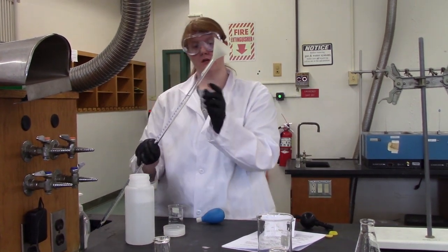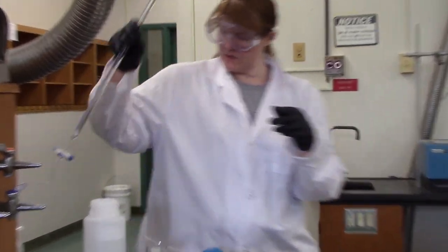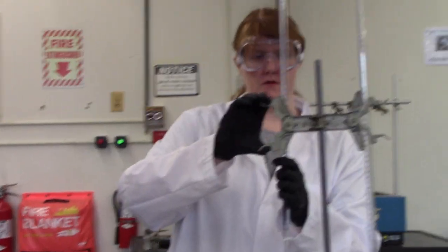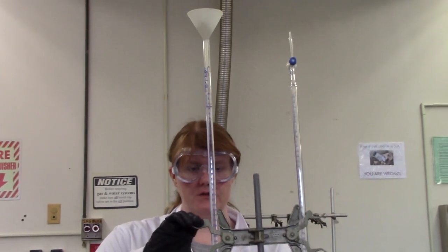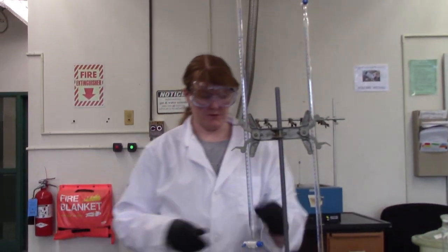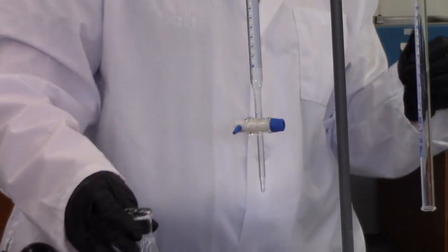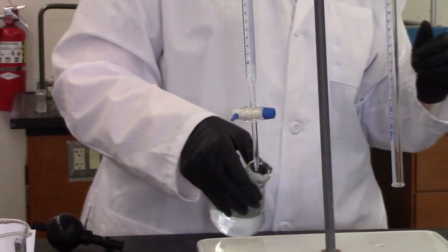Another note of caution, remember that the funnel occupies some space in here, so don't fill it too close to the top. If you do go past the 50 mark, you have to dump that experiment and do another one. Remember to check for bubbles again, because once you've drained this out, it can get bubbly. Okay, so then we're gonna record our new start volume.